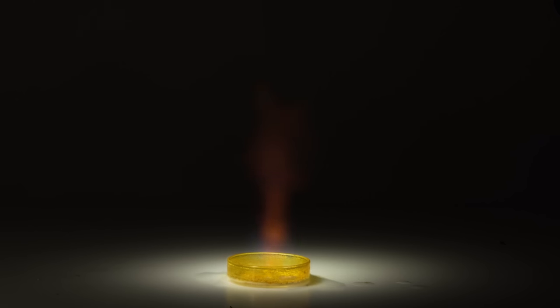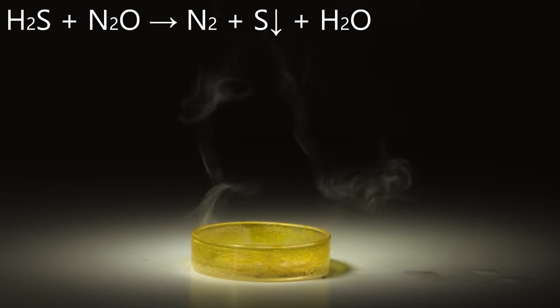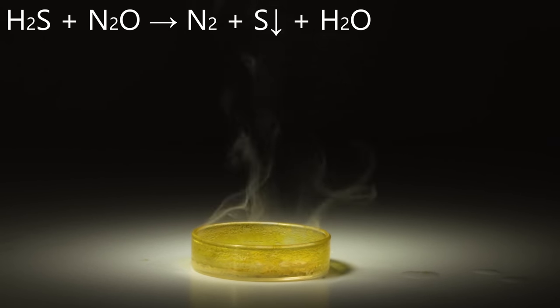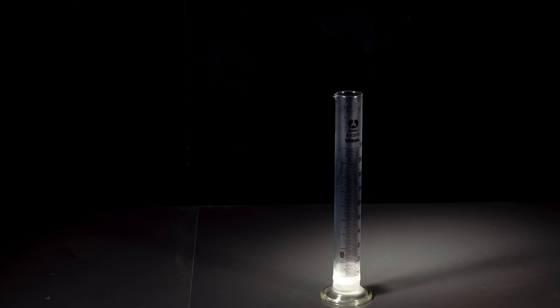Due to a large amount of emitted sulfur, the petri dish turned yellow-orange. Now let's perform this experiment in a graduated cylinder. First, I'll ignite the mixture right away, so it burns with a fascinating reactive flame. Then I'll let the gases mix and ignite them.